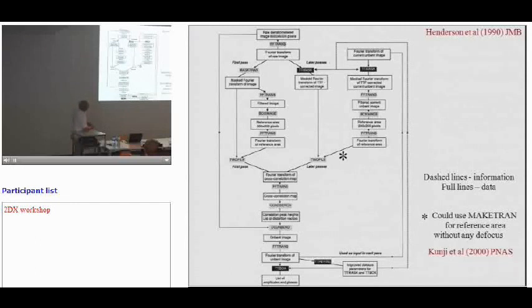And these could then be, in this 3D, put together, and you needed more passes because you were refining not just the lattice parameters and getting the noise down. You'd also be improving your knowledge of the defocus and the astigmatism so that you get your unbent, defocus-corrected, tilted image to be a better representation of the real structure. So that was this extra arm of the flow diagram that was added, with the tilted transfer function correction and in 3D.